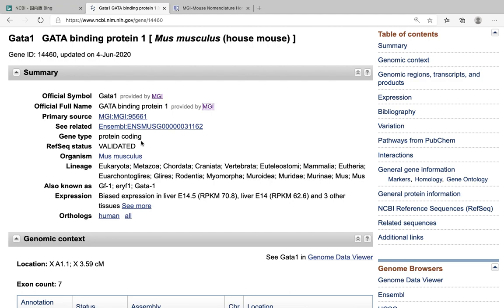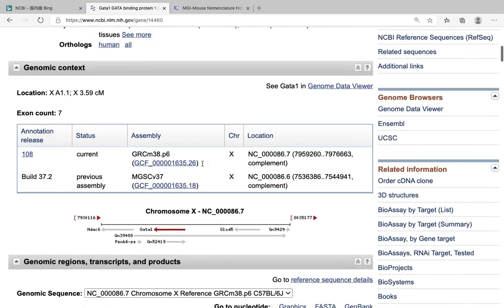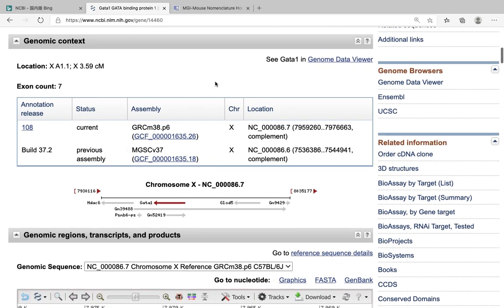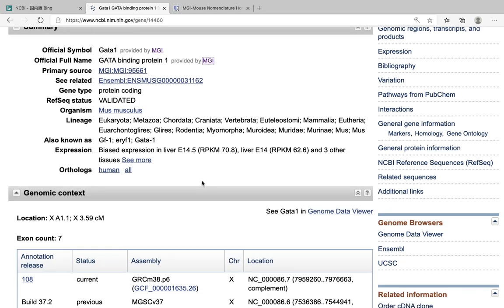Deletion of this segment in the gene can give you this result or this or this. So I will not suggest going for it if the gene is not protein coding, meaning pseudogenes. Okay, so there is also some more information.